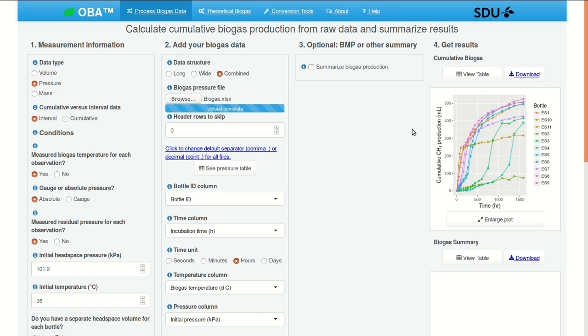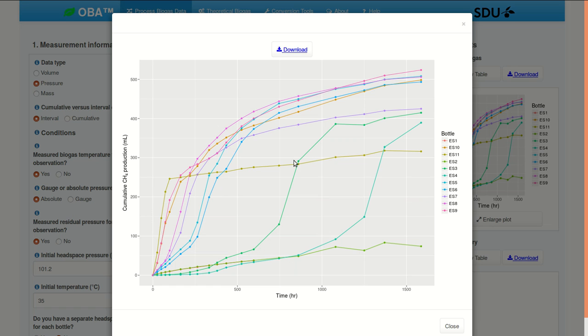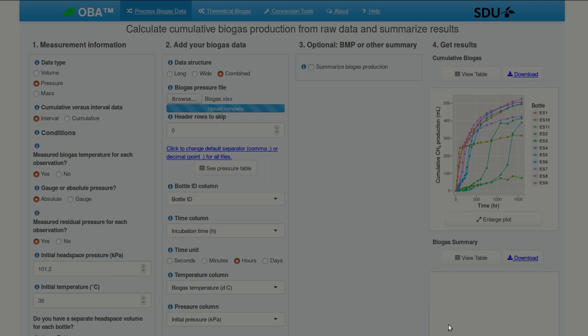And we see our results here. We can click here to enlarge the plot, and we see quite a bit of variation in the shape of these cumulative curves over time. We could look in our setup file to see what was in each bottle, but there's an easier way to look at the response on a substrate or treatment basis.